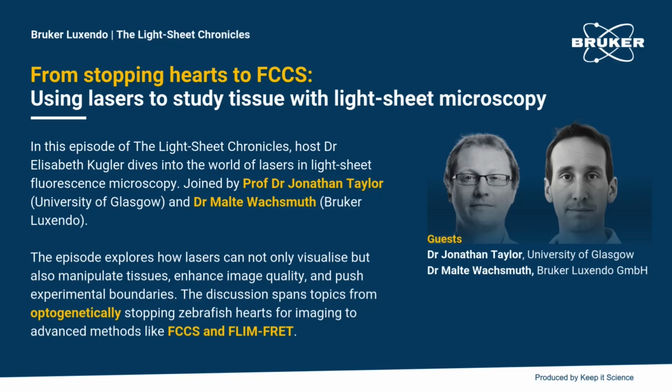I'm Dr. Elisabeth Kugler, a science communicator and your host of today's episode, from stopping hearts to FCCS, using lasers to study tissue with light-sheet microscopy. In microscopy, lasers aren't limited to visualizing tissues with fluorescence, but scientists can manipulate and reshape lasers to gain new insights, for example, on cellular behavior and tissue dynamics.